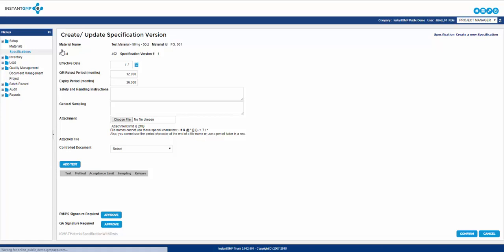The first box presented is the effective date. This should be saved for the QA signature you see at the bottom. This is because upon completion of signatures the effective date is set but is still able to be edited until both signatures are entered. Following this is the QM retest and expiry period. Now this will be auto-filled if you enter this information into the material information. If not, you can enter it differently for different specifications for the same material.